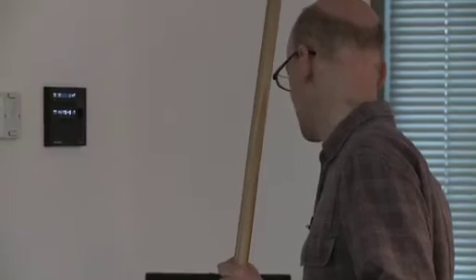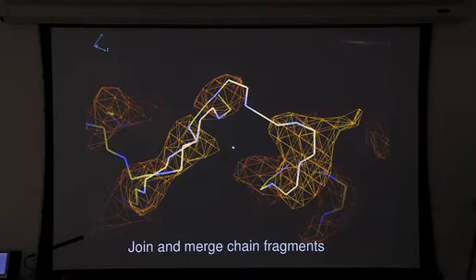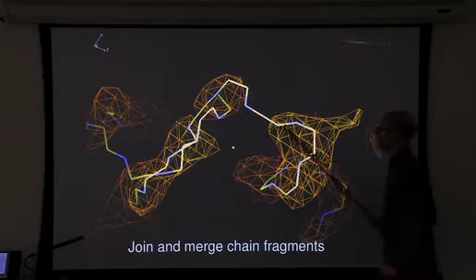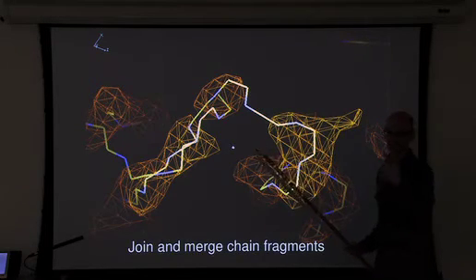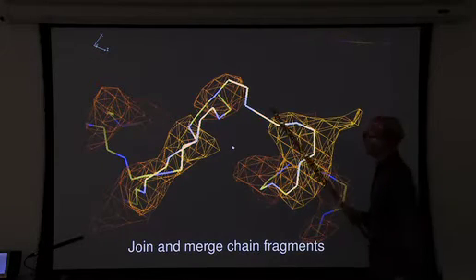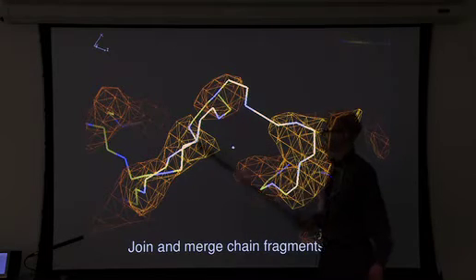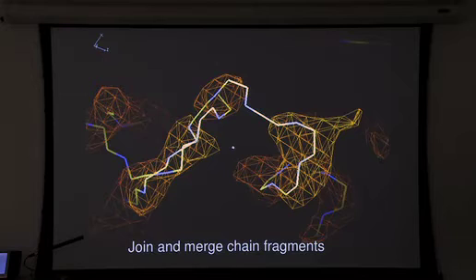Right, so the next step is to merge the ones which are telling us the same thing. So that gives us that. Everything merges here. Where we had a choice of routes here, we always take the longer one because that means we get the helices right. Otherwise, we take shortcuts down the middle. We couldn't resolve this one because it's running in the opposite direction and it branches off. But that's the best we can do at this stage. We can't resolve that yet.